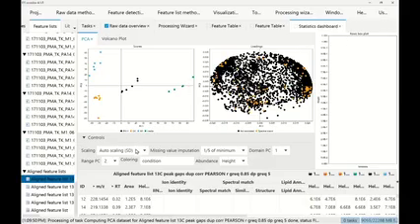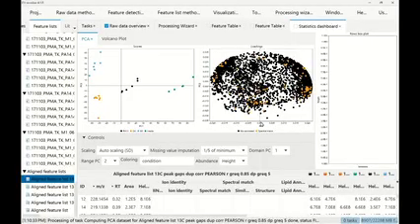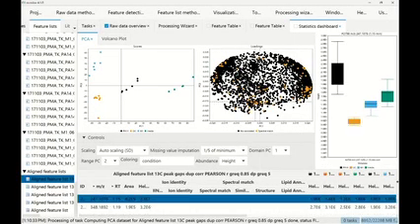And then in here we have some scaling that we can do. We have missing value imputation. We can set the domain principal component, also the principal components 1 and 2. Coloring, and also which abundance we use. So maybe we want to use area, and then everything is just recalculated when we change this. You see it's automatically recalculated, and now we can, for example, click on the features here.